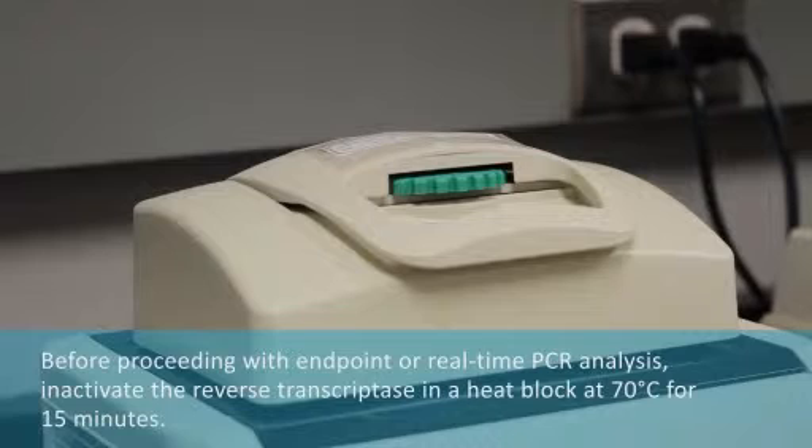Before proceeding with endpoint or real-time PCR analysis, it is important to inactivate the reverse transcriptase in a heating block at 70 degrees C for 15 minutes.